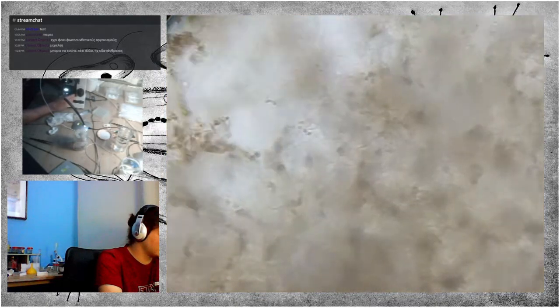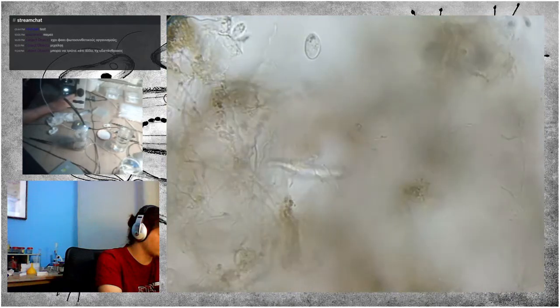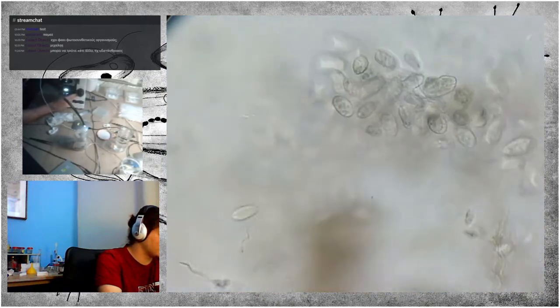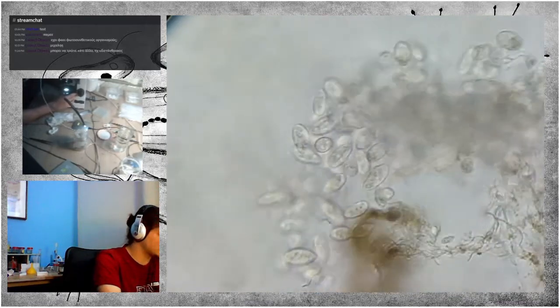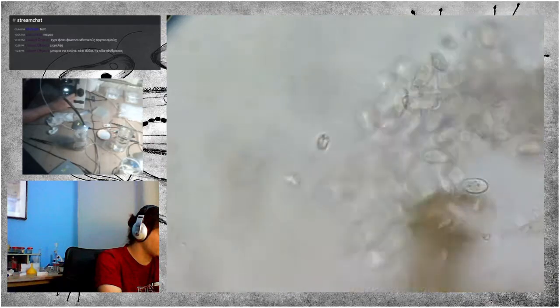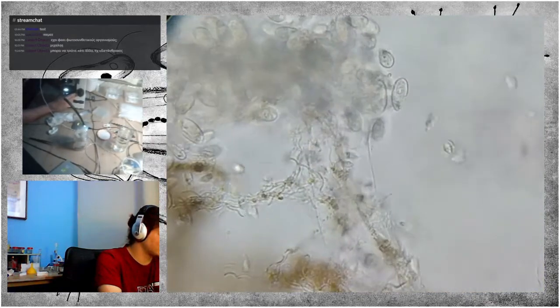No, that's the biofilm, and that was a copepod larva, but here is a very large clump of ciliates stuck again for some reason in bacterial colonies.